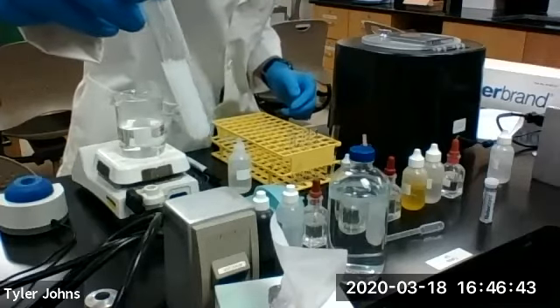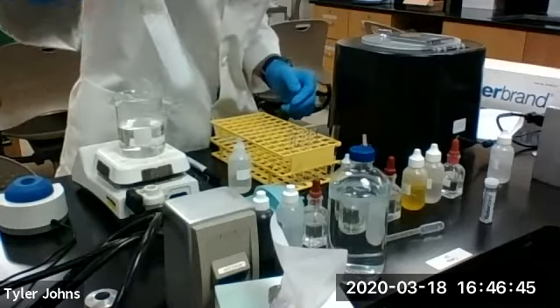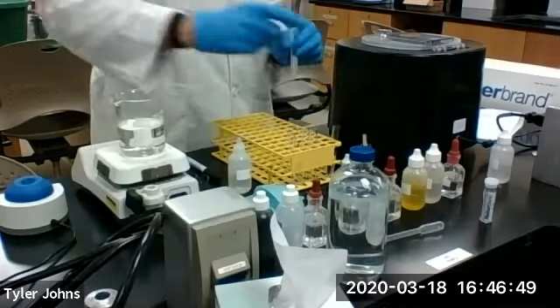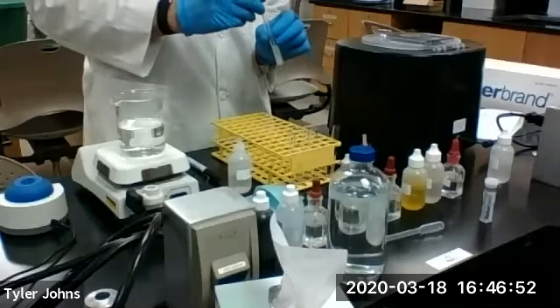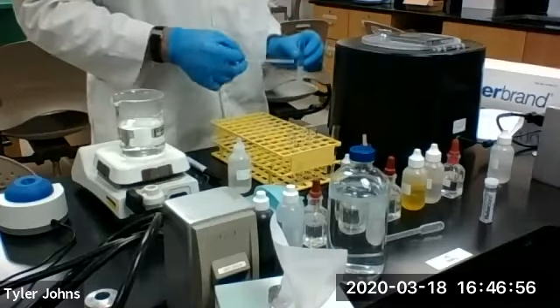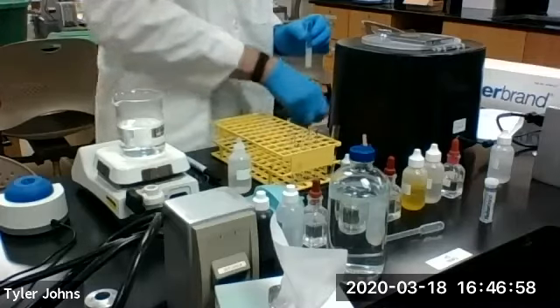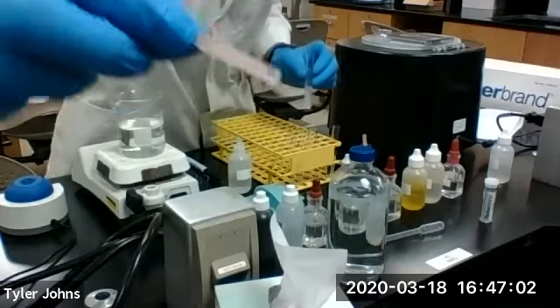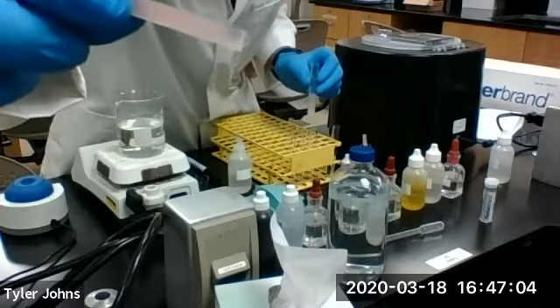See, with the first drop, we already had some precipitate forming. So we're already basic.